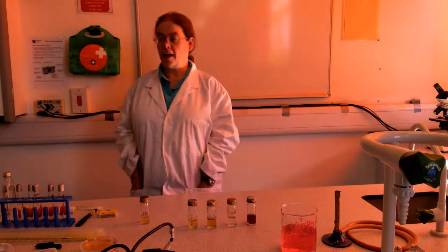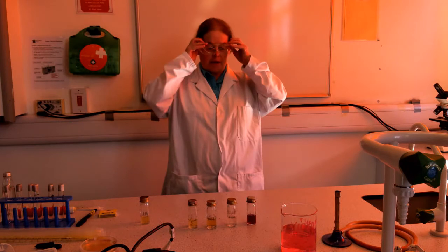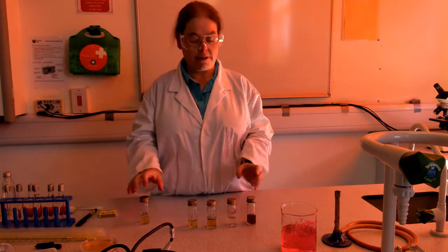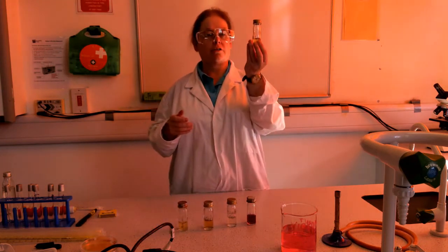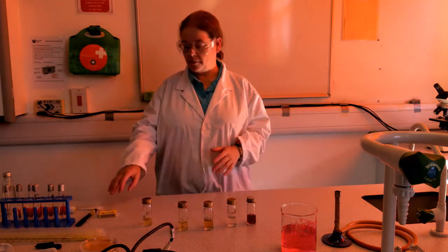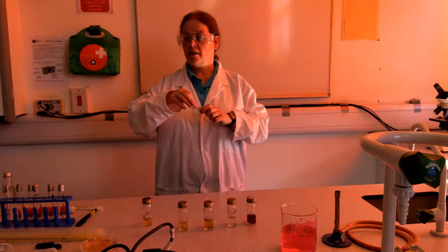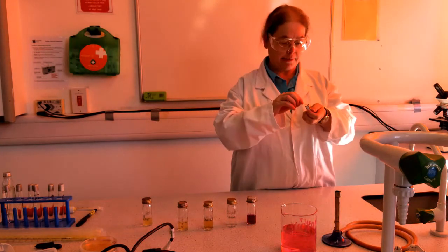Right, okay. So, what would you have done had you been in college? Well, the first thing that you would have needed to do was to inoculate the different growth media with a culture of bacteria. So, I will demonstrate that. I've already cleaned my bench down, washed my hands, etc., and done all the normal safety precautions.